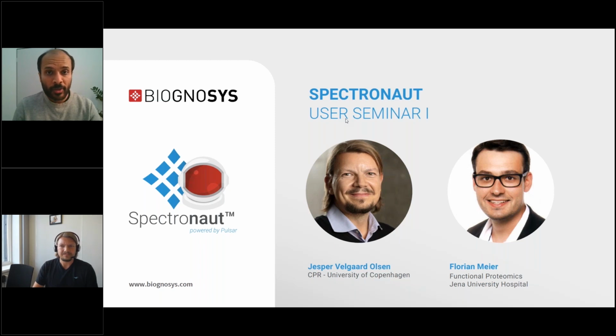One of my first interactions with Jesper and his group was at ASMS 2018, so around 2 years ago. It was at the end of the day in a rapidly emptying poster hall at one of these huge ASMS poster halls. Both of our teams had gathered at a makeshift table between one of these many poster rows to discuss the problem of PTM localization in DIA. This led to a very fruitful collaboration on our side, led by Lucas Reiter and Oliver Bernhardt, which ended up producing an impressive PTM localization workflow in Spectronaut and a Nature Communications publication.